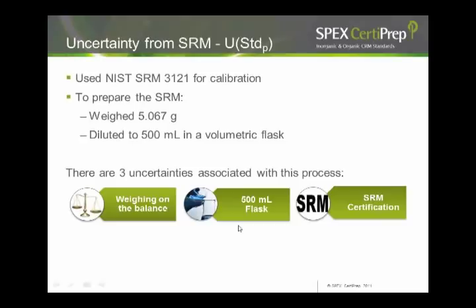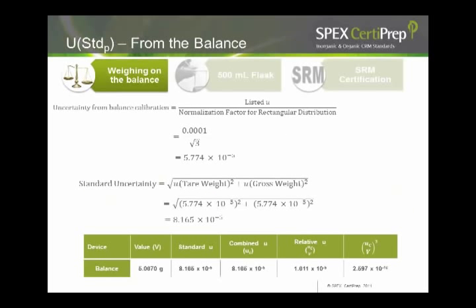So first and foremost, I have to determine my concentration. That's one of the goals. Now what is the equation I used? The concentration of gold in a sample is the concentration I measured from the ICP, the standard concentration that's prepared from the NIST SRM, and the dilution factor that I used, divided by the measurement of the standard by my ICP. This is the ICP measured concentration. These values are plotted here, and when you apply this, you would be arriving at 10,004 milligrams per liter. How we arrived at these values is shown here. I will be explaining a bit later in my slides.